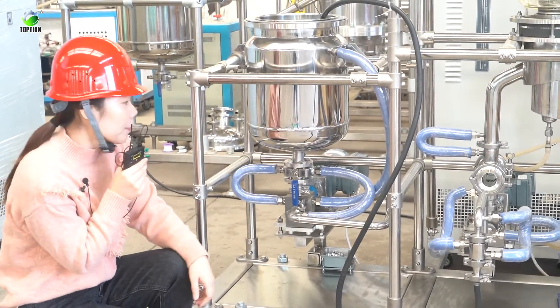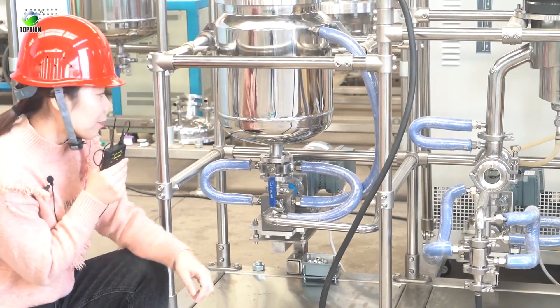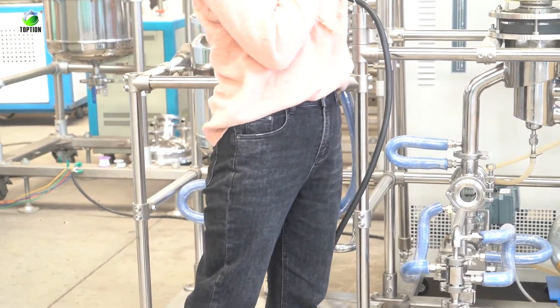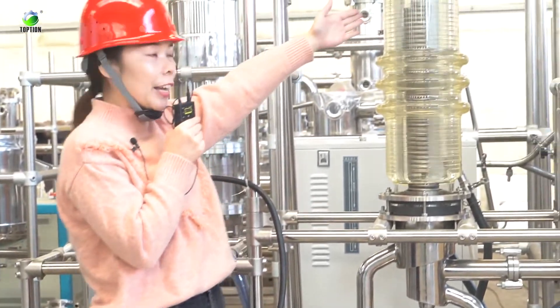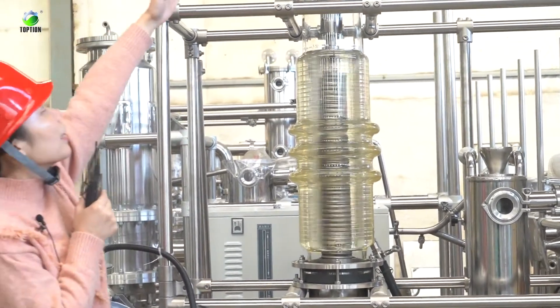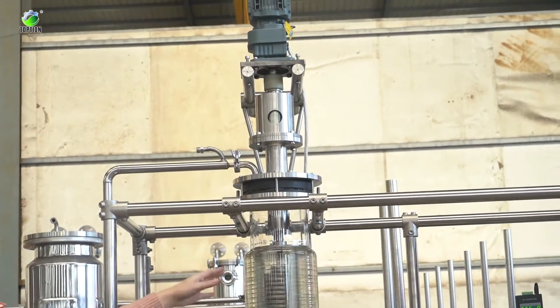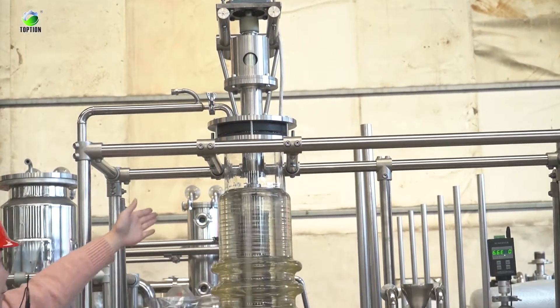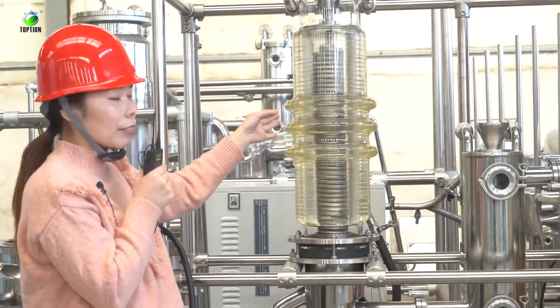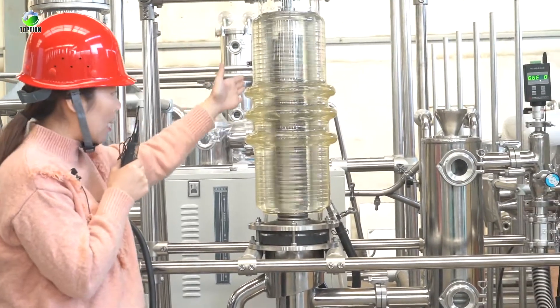All the pipeline is heat-insulated. After this, the material will be fed into the main evaporator. On top of the main evaporator there is a motor — you can see the motor is swaying and rotating now.